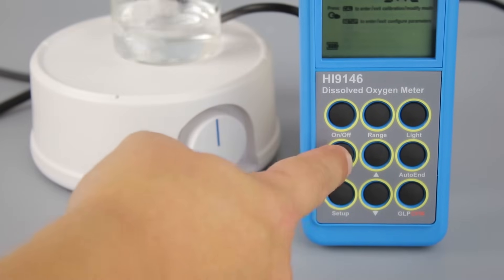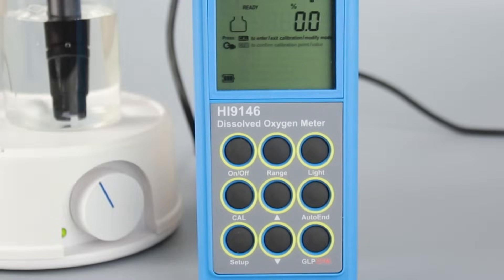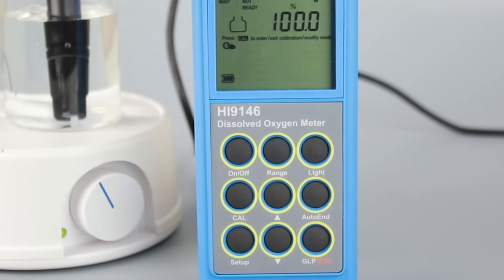Press CAL, then submerge the probe into the solution, having it stir gently for 2 minutes. Once stable, press CFM to confirm the calibration point. Press CAL again to save the calibration and return to measurement mode.